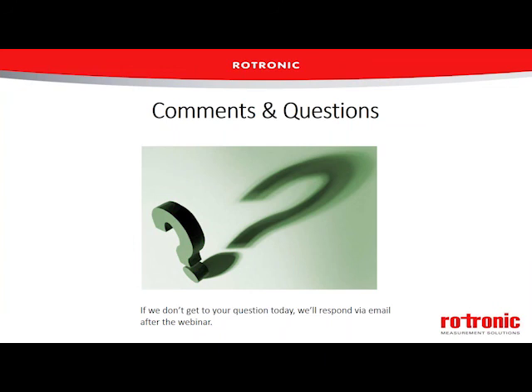Here's a good one. This is from Jamie. Other than the reference uncertainty, which other factors affect the uncertainty on relative humidity calibration?